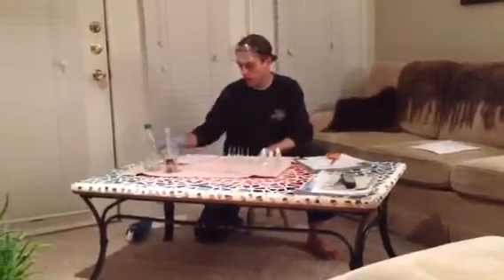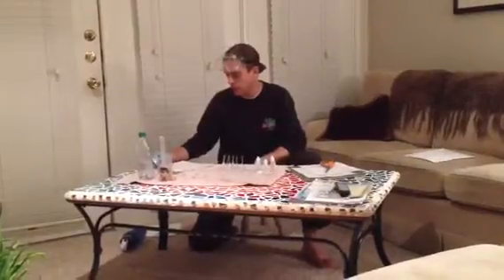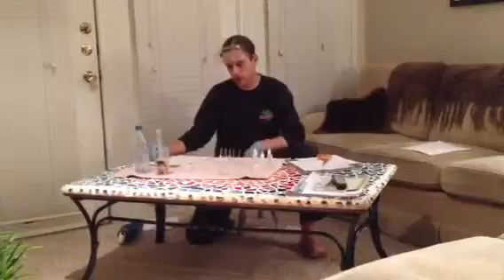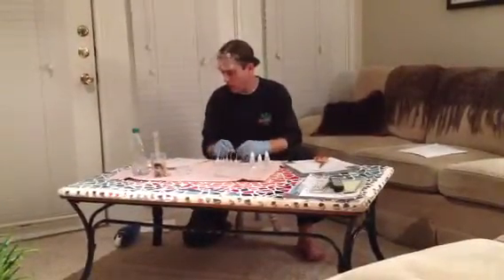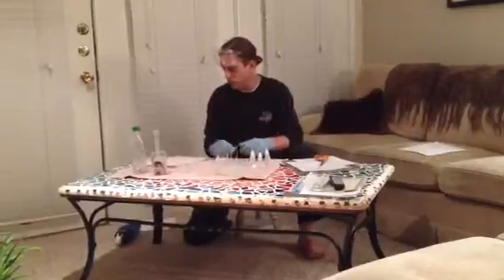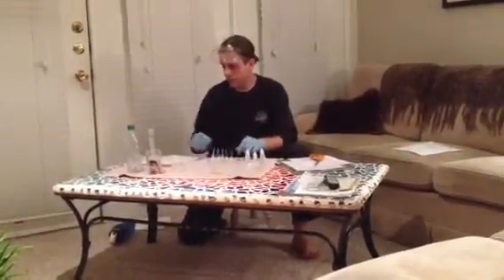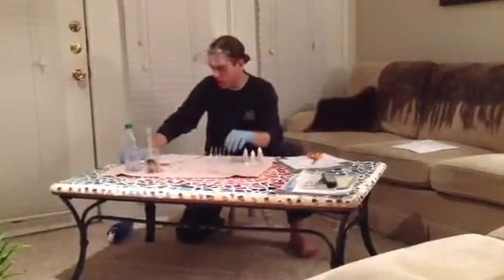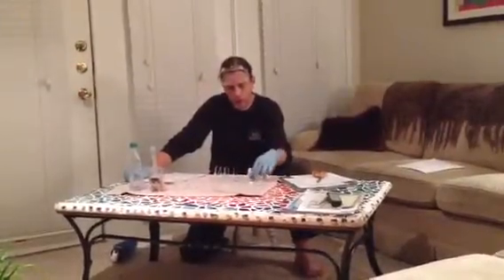Within the experiment bag I was asked to get tonight, were quite a few chemicals. These chemicals being ammonium molybdate, aqueous ammonia, barium chloride, nitric acid. I've got an organic reagent right here.